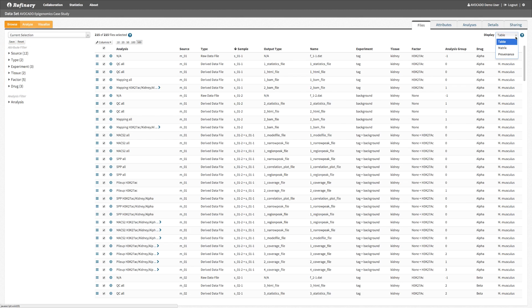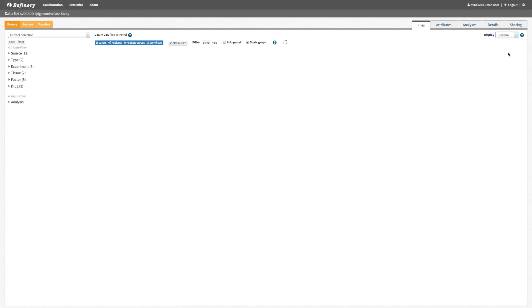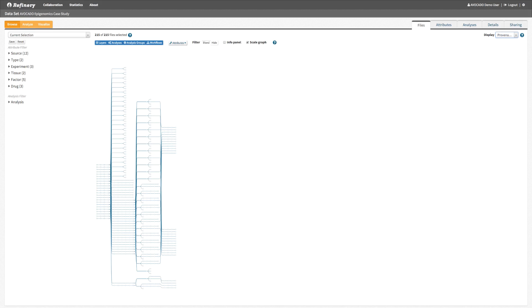In addition to the metadata attributes, we have also captured the data provenance for these files. Here is the representation of the provenance graph as a simple node linked diagram.